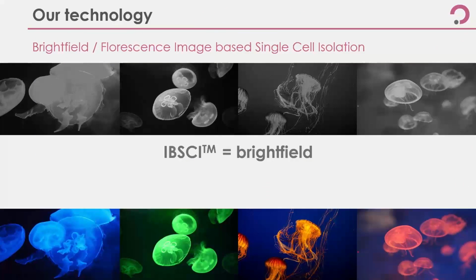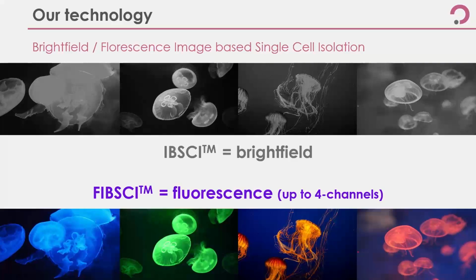So as I said before, the technology can be used either with bright field or with fluorescence imaging to choose on which parameter we can apply to isolate the cells. So we can work in bright field, but also with fluorescence and up to 4 different channels.